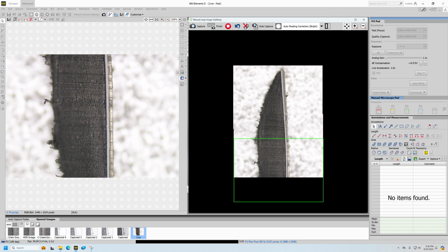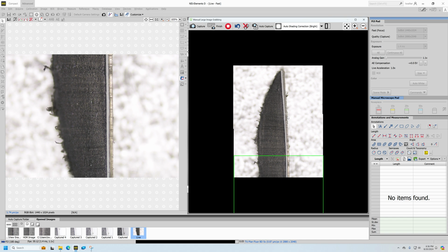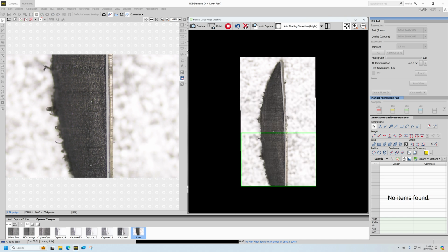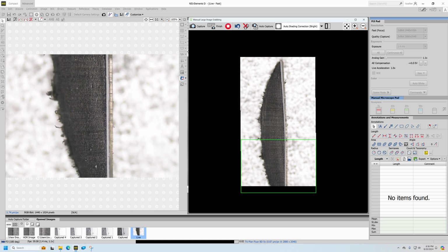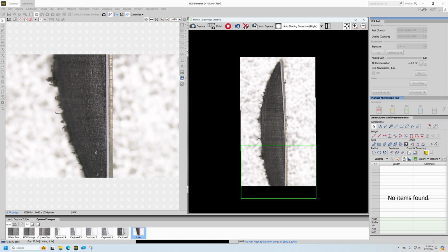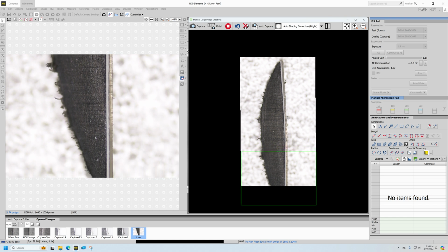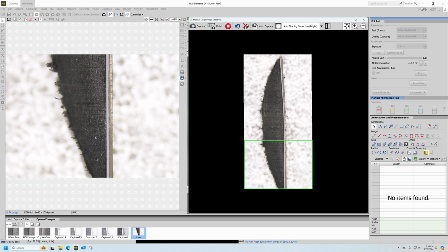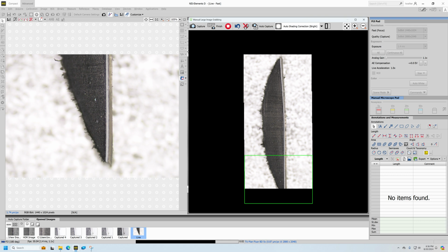and I try to leave a bit of an overlap between each adjacent field, because I want to make sure that the software has adequate overlap between each field so that the pattern recognition can work the best. I press spacebar again. Same thing, press spacebar again. Then we should be just about to the end. So something like that. Spacebar again.